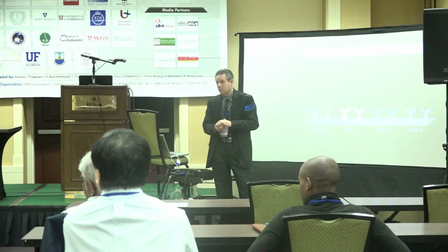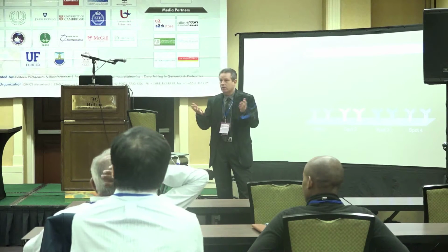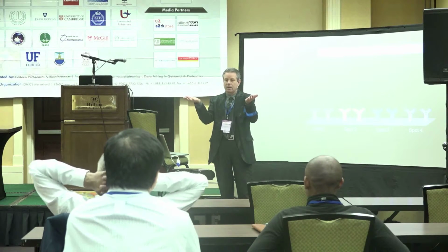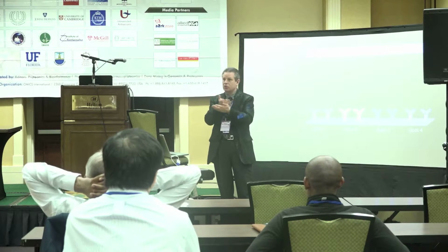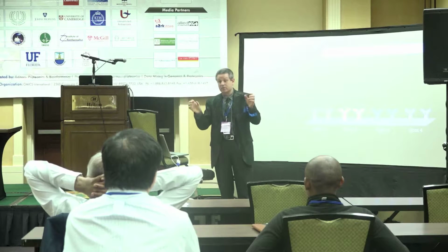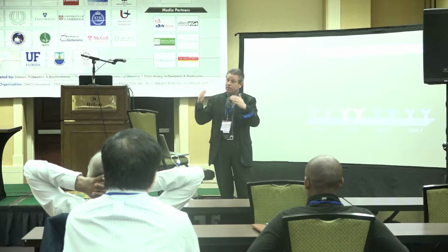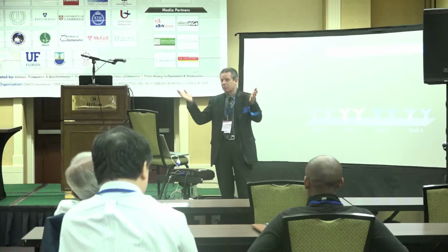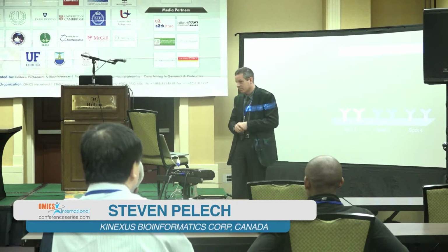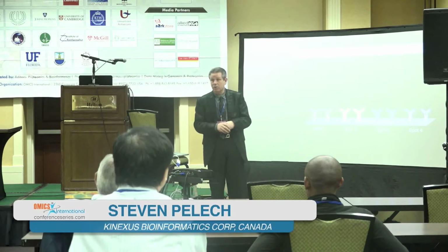What you have is just presence or absence, increase or decrease. So you don't have quantification of the intensity of the change or of the increase. Well, they're relative to each other. So what you do is you take the signal for your treatment and your control, and you then calculate from the signals the percent change from the control. And then you measure your error in your signals, and you sum up the errors, and that gives you a good sense of what if your percent change from control is 100%, and the sum of your errors is 30%, you have a higher confidence. That's a real change. So you can quantify the change. Yes, absolutely. We quantify every spot.